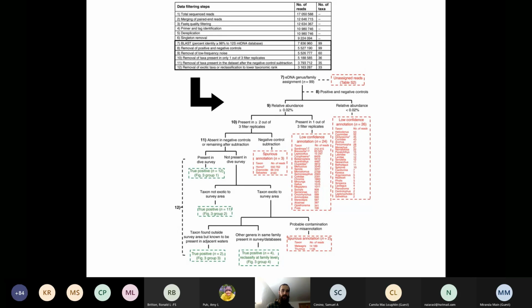And again, I think this can be something that's not super satisfying, or can feel kind of hand-wavy as you're going through this. So it's important, in order to feel more confident of your results, to lay out strict rules, to have a tree like this, for example, to understand why you're removing sequences that otherwise seem to infer to species.